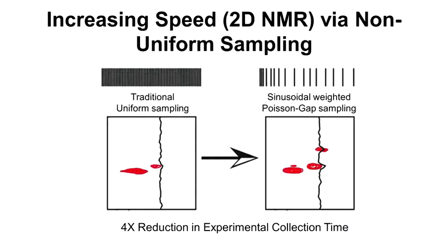And in the case of 2D, it also helps with a reduction in time, up to a 4-fold reduction in time, and then for 3D on the order of perhaps a 100-fold reduction in overall time.